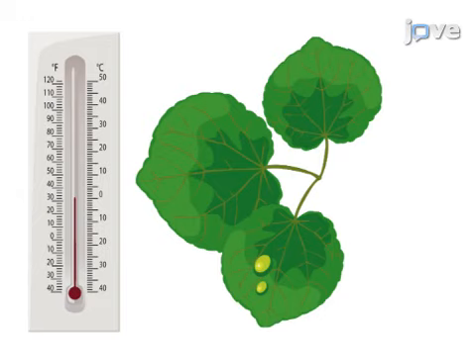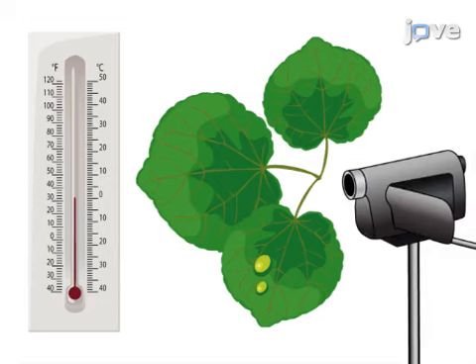As a second step, the plant is placed into freezing temperatures and positioned so that it can be visualized with a high-resolution infrared camera. The parameters of the camera are then established, which will allow the researcher to observe ice initiation and propagation. Next, the temperature of the chamber is slowly lowered to sub-zero temperatures in order to induce the surface INA bacteria to freeze, which will then induce the plant to freeze.